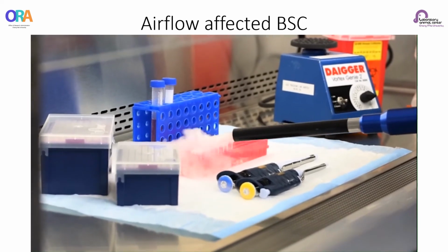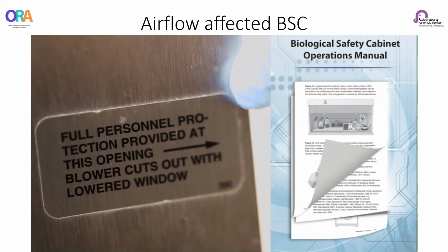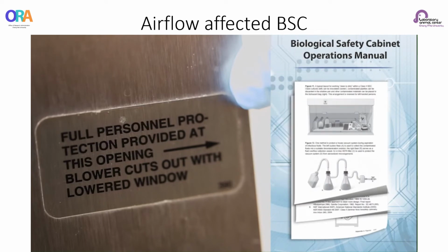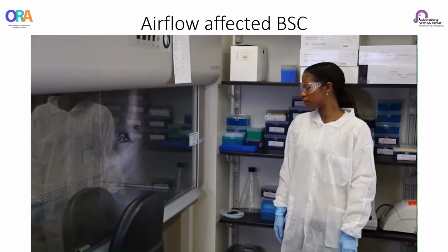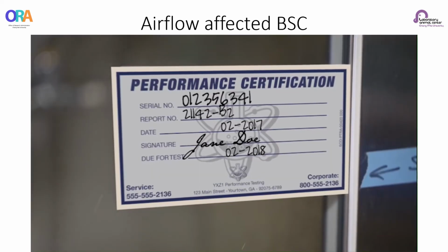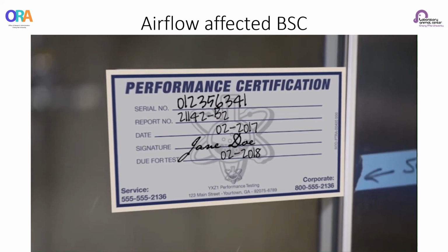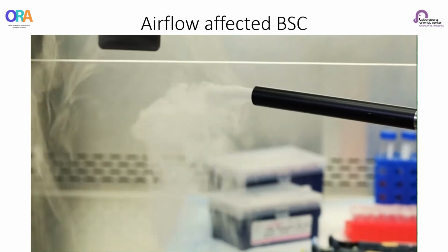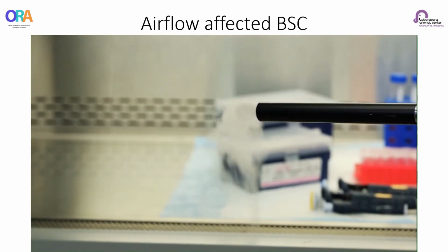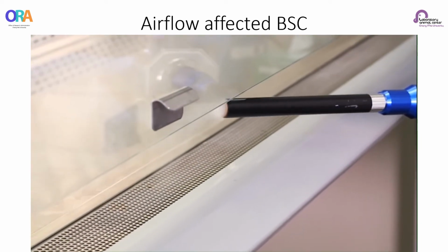Proper sash height is critical because when the sash is kept at the proper height, the appropriate inward airflow can be maintained. The proper sash height is designated in the BSC operation manual and should be clearly indicated on the BSC. The performance of the BSC at the declared sash height is actually part of the cabinet certification process. If the sash is too low, inward air velocity will increase at the opening, which can cause turbulence and potential contamination inside the cabinet.